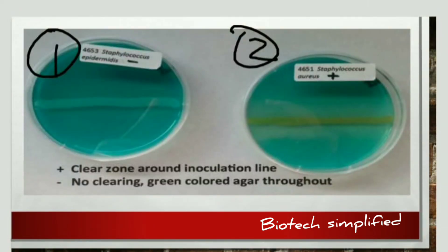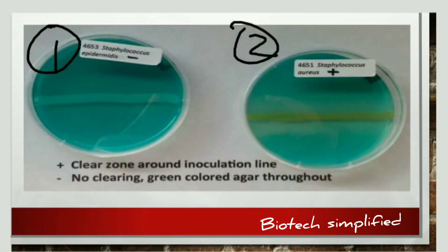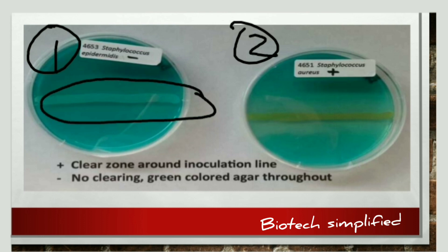In this image there are two petri dishes, both containing the same DNase test medium, but with different organisms. The first petri dish contains Staphylococcus epidermidis. The area around the colony is green, the same color as the medium, indicating that the DNA is not hydrolyzed. So this organism is negative in the DNase test.